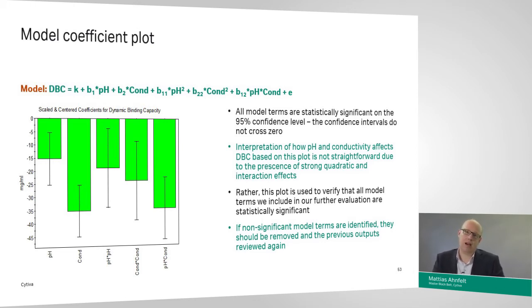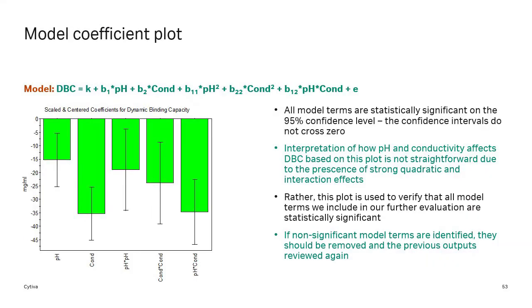Starting out, one would look at the individual parameters in the polynomial and assess each of them for significance to see if all model parameters were statistically significant or not. So for this model we're looking at now, we have 5 parameters in the polynomial model plus a constant term. The 5 model parameters would be, starting from the left, the linear term for pH, which has an estimate this size, and then with a confidence interval around it like this.